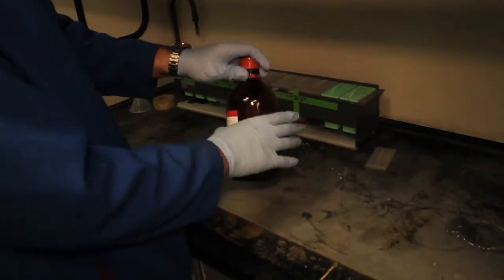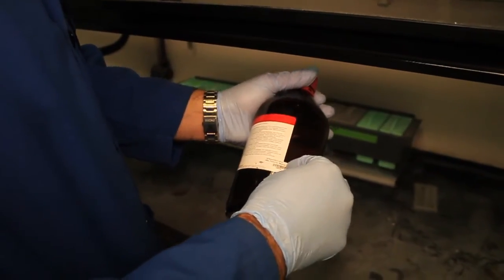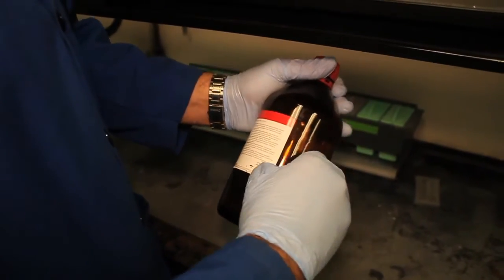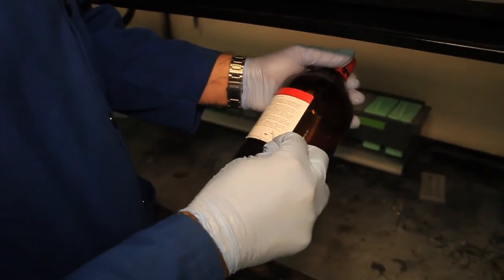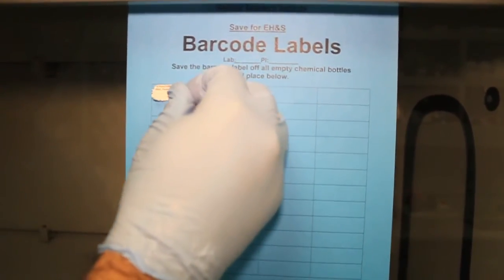To properly dispose of an empty chemical bottle which contained a liquid, first peel off the chemical barcode label that is attached to the bottle. Place it on one of the barcode label sheets provided.